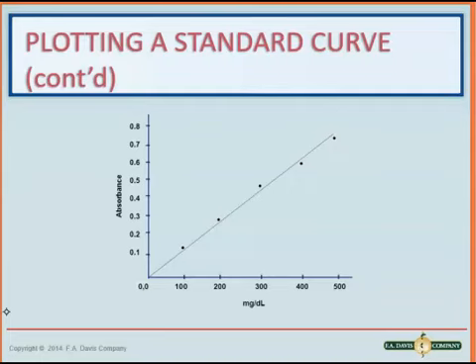standard curve. This graph has 5 points on it of different working standards, and a standard curve was established. Well, you could really even say 6, because we could say our origin is the first coordinates on our standard curve.